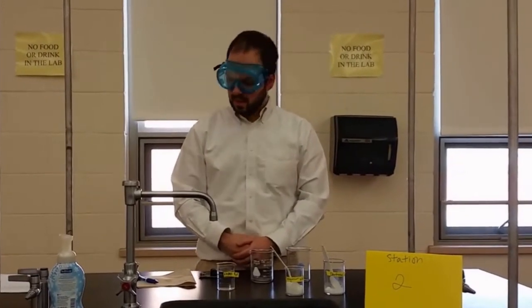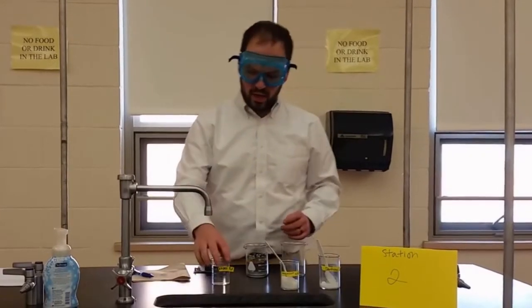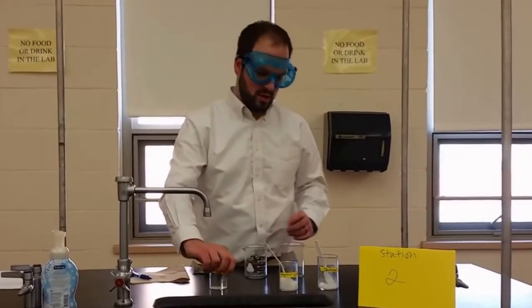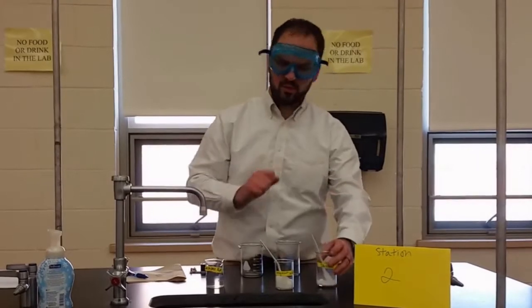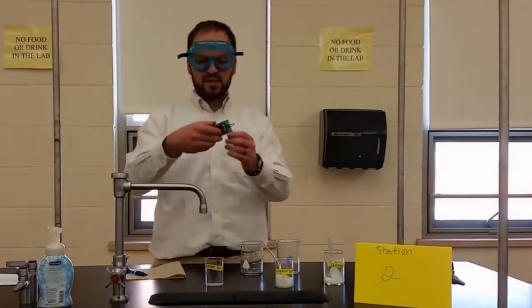All right, this station is station number 2, which is the conductivity station. We have a container of some distilled water right here. We have 2 chemicals in the containers. You're going to want to write down what these chemicals are. And you also have a conductivity meter.